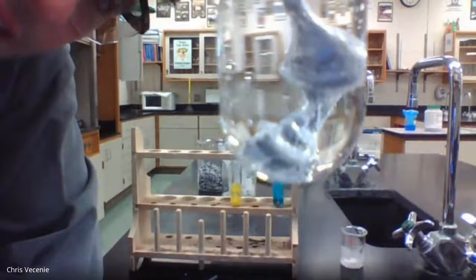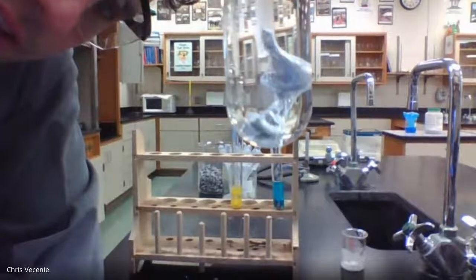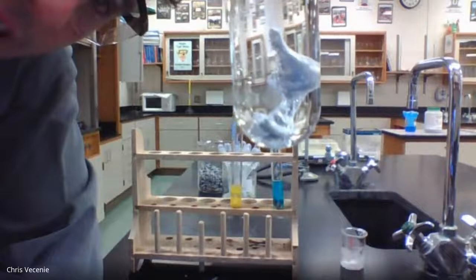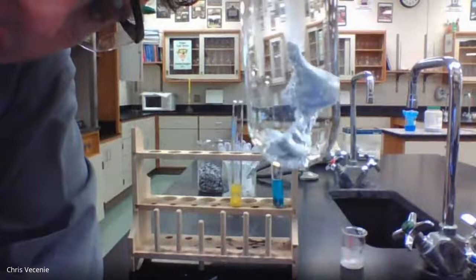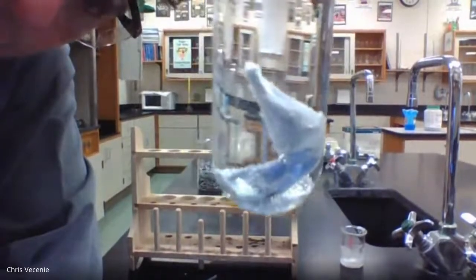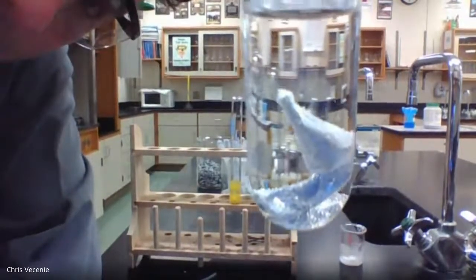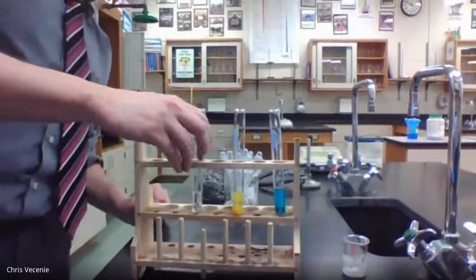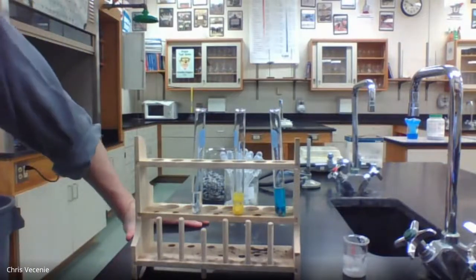But if you take a look, sure enough, you're seeing a whole lot of bubbles forming on that metal. Lots of bubbles coming off the surface of that metal, and you're seeing them gradually make their way up to the top of the tube. Now let that go, and I'll show it to you again. Sometimes it gets a little more magnified as we keep going.